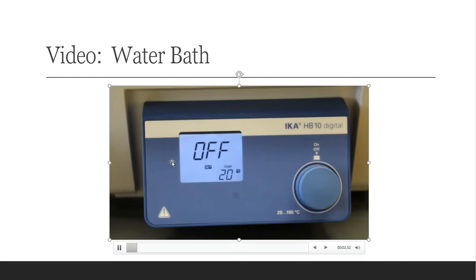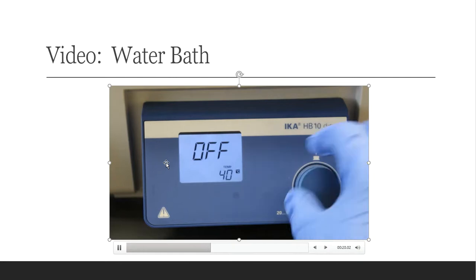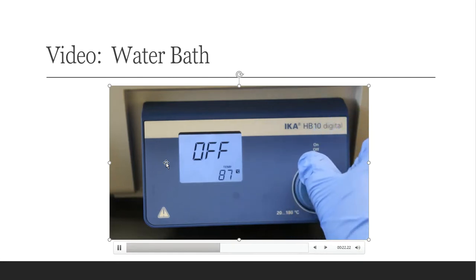So I have filled my water bath with water, all right? And the reason I did this is because water boils at 100 degrees. My oil has a boiling point higher than 100, and my petroleum ether has a boiling point lower than 100. So I'm not going to dial this all the way up to 100. I'm going to go close, and I'm going to put this at 95 degrees.